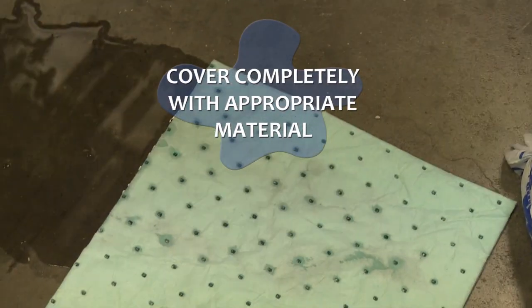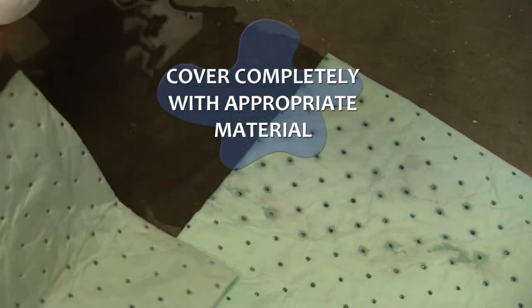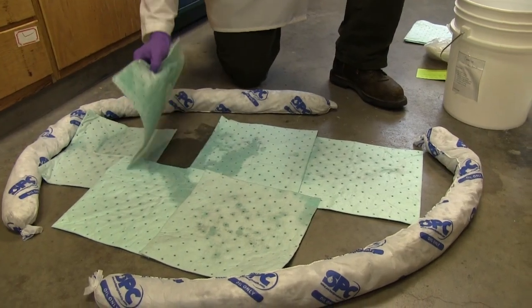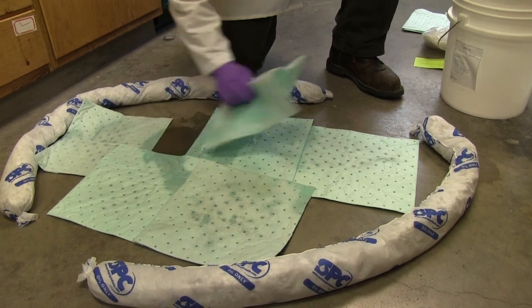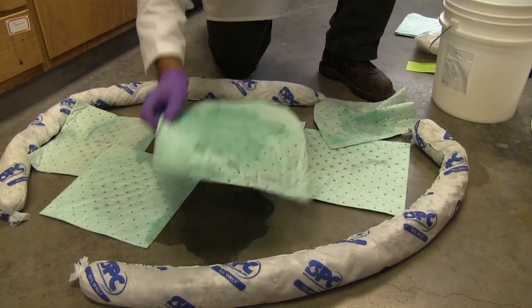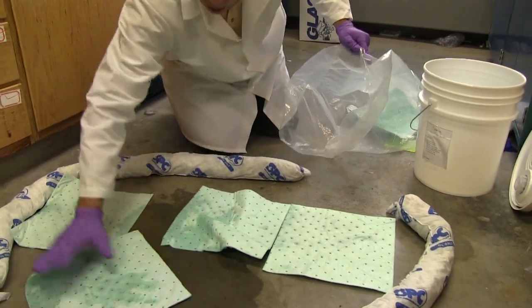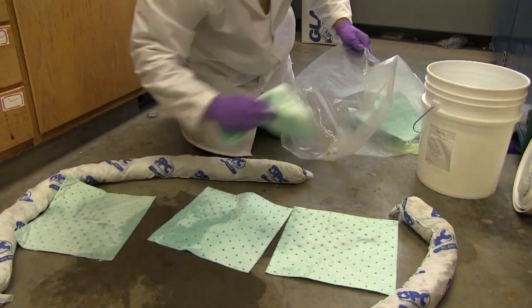Set the universal spill pads onto the liquid and wait a few minutes for the chemicals to absorb. Begin removing the universal spill pads and wipe up any residual material. Put the used spill pads into a plastic bag. Unused spill materials can be placed back into the spill kit.